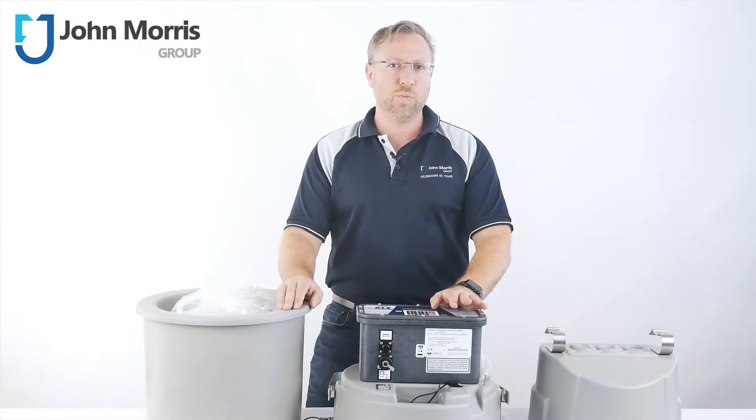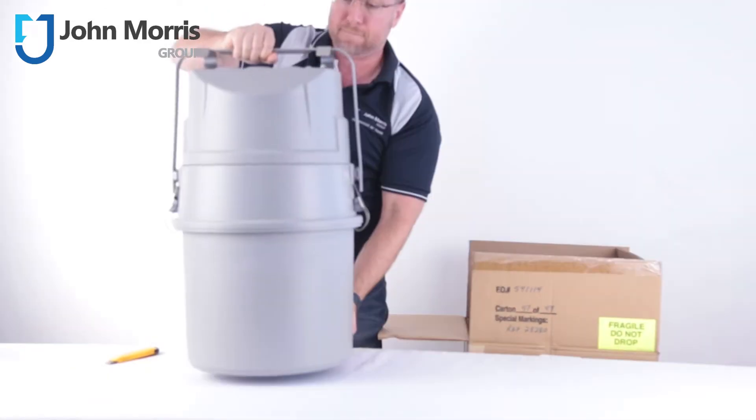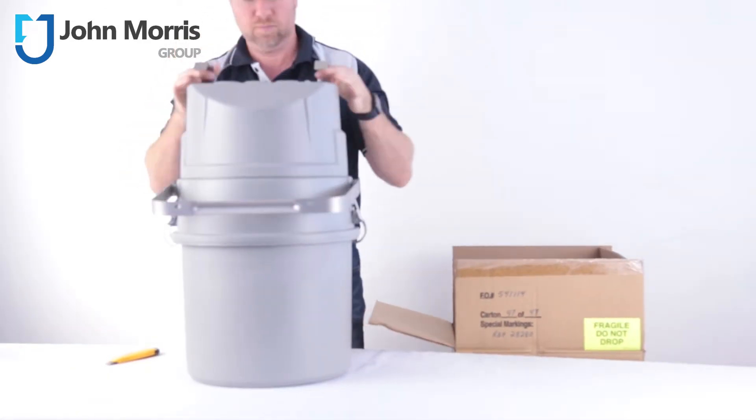This sampler features a single bottle in sizes ranging from 4 to 10 litres. We love it because it's easy to wrangle and easy to use.